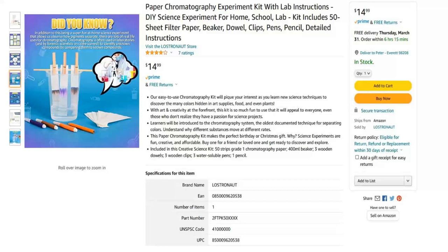So this is the kit I bought. It's about $15. It is a pretty simple high school level paper chromatography experiment. Includes the beaker paper and pens, and with a couple of additions like some extra solvents and some highlighter pens, you can make some pretty neat time-lapse video like this.